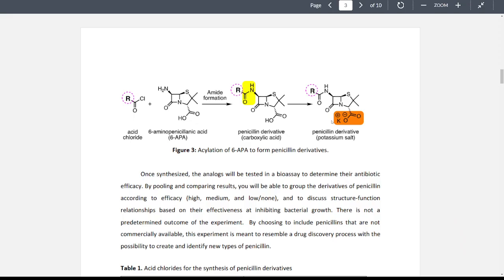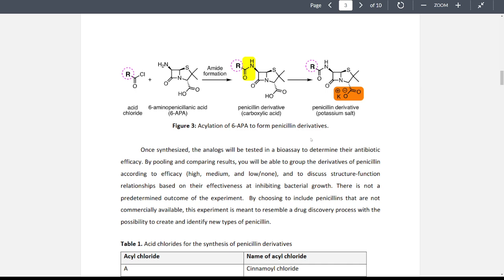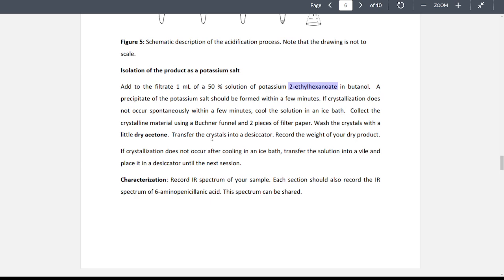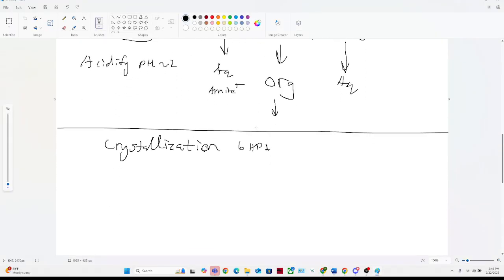Butanol has one hydrogen bond donor and acceptor, being the OH group. But at the same time, to be perfectly honest, it's relatively more nonpolar. Nonpolar enough, I'd say, and so would the pre-lab, that it's enough for it to crash out. You can also facilitate that crashing out by reducing its solubility using an ice bath.